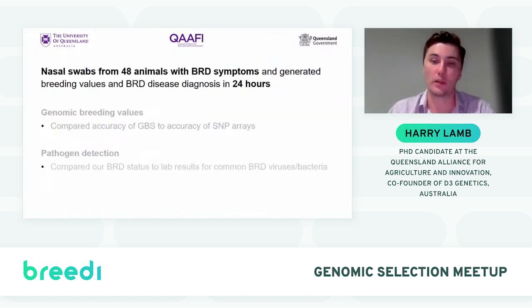So for this study, we went out and we took nasal swabs from 48 animals in a feedlot that were presenting with bovine respiratory disease symptoms. So they had that snotty nose and they had a temperature and they looked like they were sick. And then our goal was to actually generate breeding values and also diagnose whether they had bovine respiratory disease or not within 24 hours. Next slide.